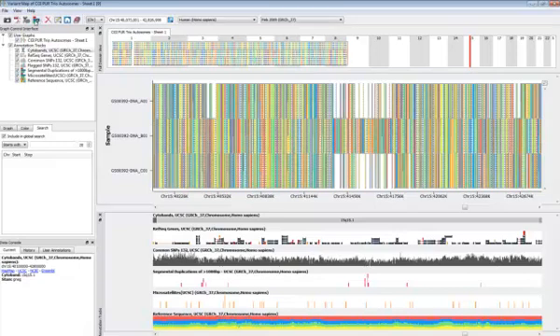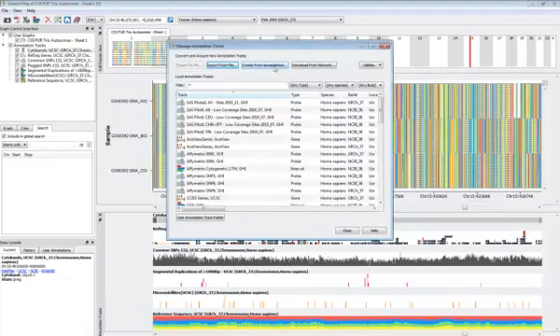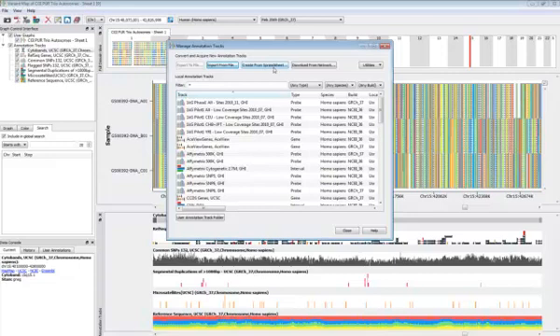We have available a large number of other tracks in our download server but also you have the ability to create your own references and both use them in the browser for visualization but also for analysis purposes. You can create tracks from any spreadsheet or import from a file. All you need to have is a genomic coordinate and some data point that you would like to include there.